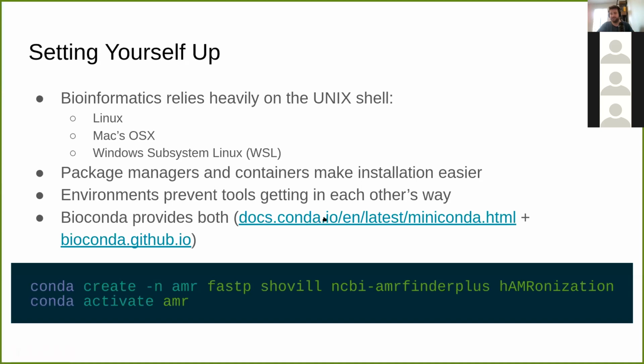So there's, again, instructions on the repo of how you install Conda on your system, depending on your system, it's a full set of instructions, and then instructions on the Bioconda website on how you set up Bioconda, how you set up Conda to work with bioinformatics tools.